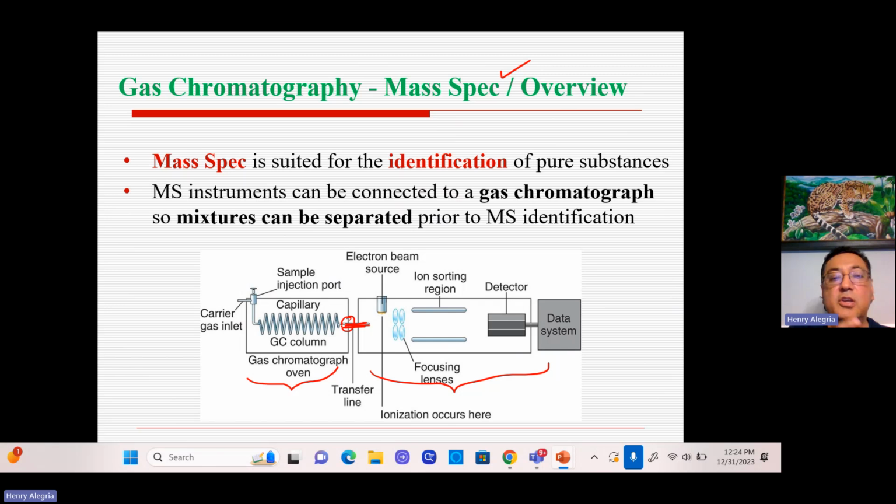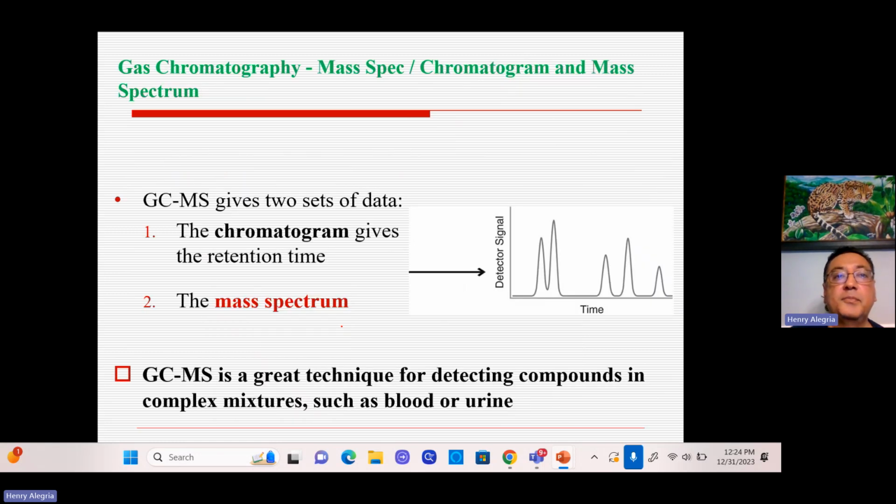And so each of the 3 components of the mixture passes through the mass spectrometer one at a time, and I can therefore get much better results with the mass spectrometer because it's analyzing each molecule one at a time. So the mass spectra that I get is for each molecule one at a time. Right? So this is a very valuable way of doing things.